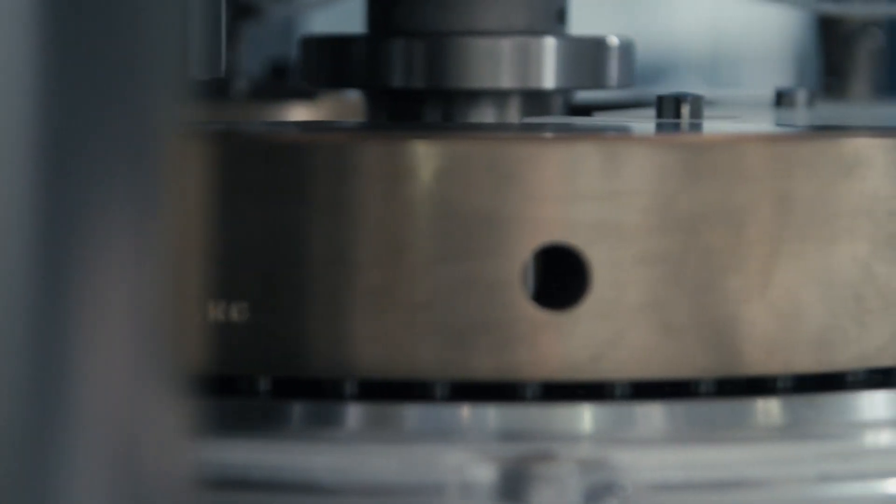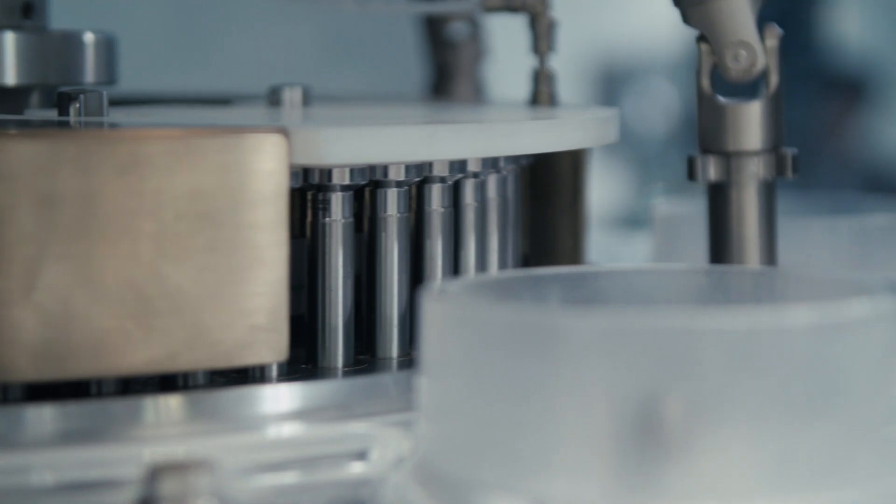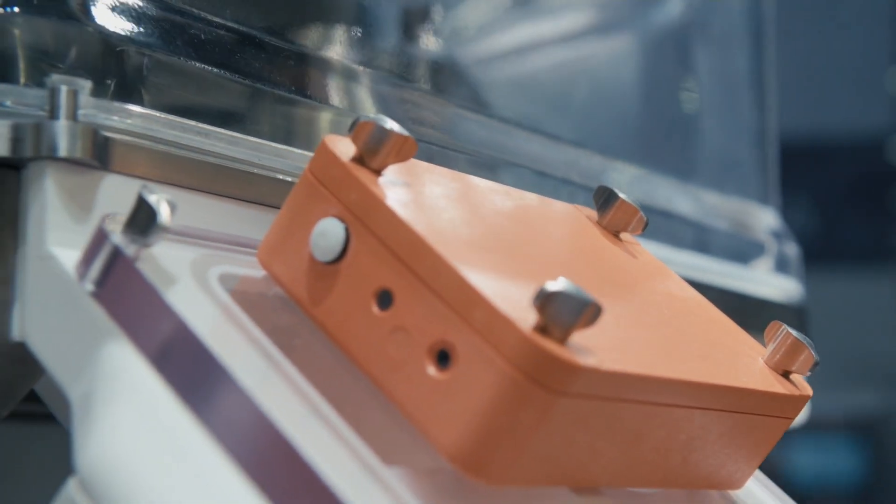From a productivity standpoint, the exchangeable compression module has been completely redesigned — it's much easier, has a much better setup, is much lighter, and therefore provides a much better containment level than in the past. This means the inside of the machine is completely clean and does not require any cleaning, enabling very fast product changeover and allowing a much bigger volume of tablets to be produced over one year.